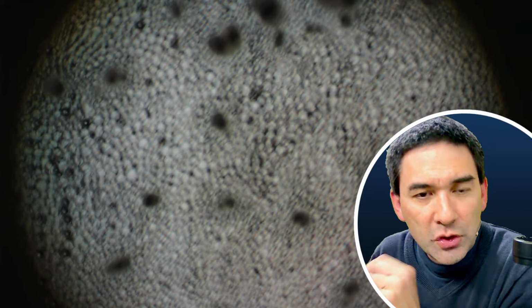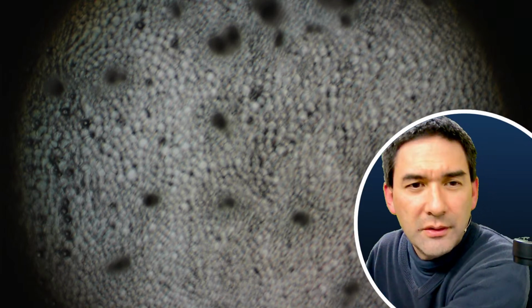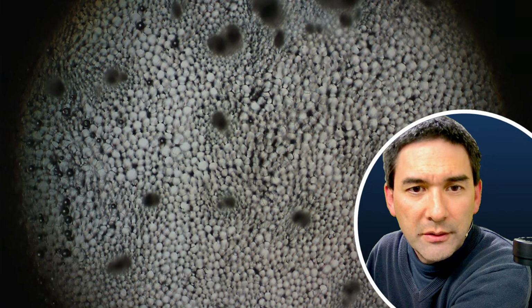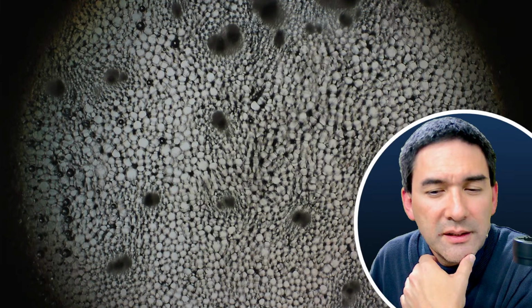What I'm going to try is to quickly deactivate and activate it again, because, yes, now it works better. Okay, so this is now the 40 times. Why don't you see, just a second, the stage?